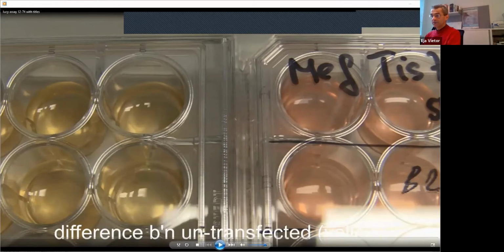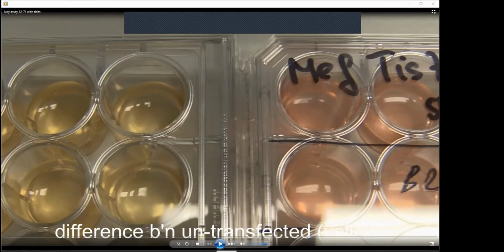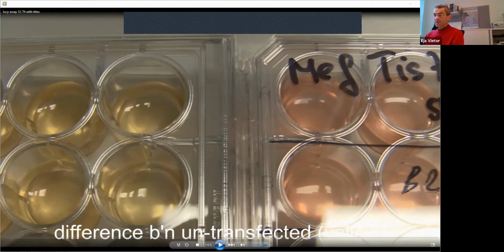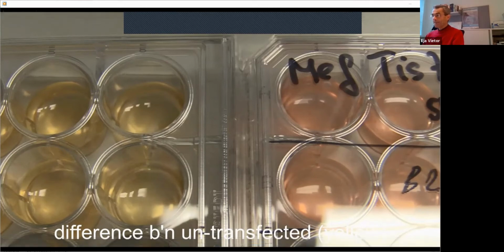Yes. Okay, fine. So this is the beginning of the next procedure, which is done 2 days later. Here I put next to each other 2 different plates. On the left side, you see non-transfected cells. On the right side are transfected cells. So what is the difference between these 2 plates? What do you obviously see? The color of the medium.